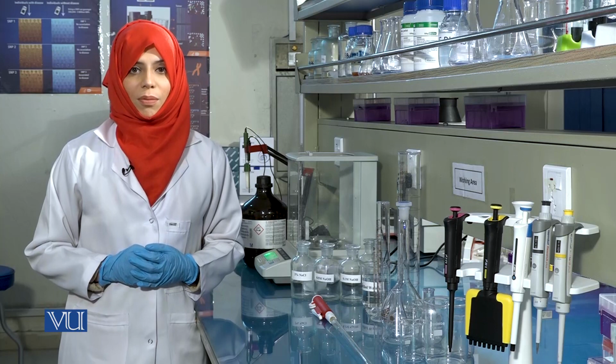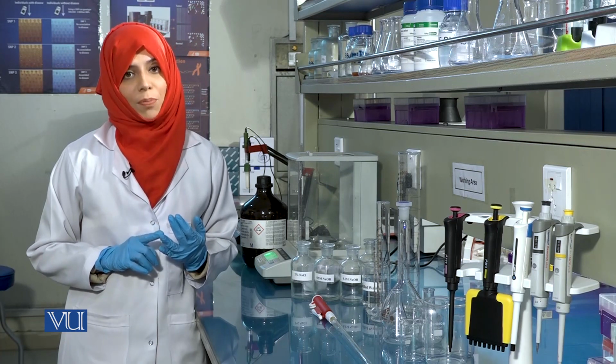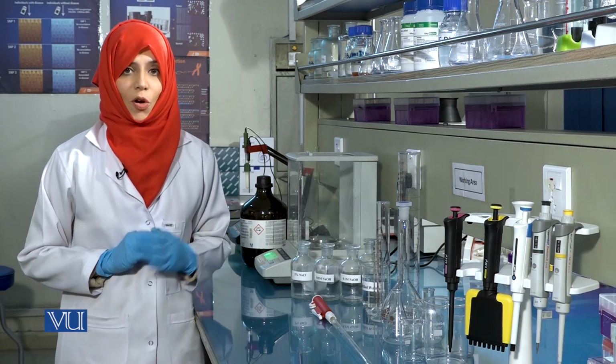Dear students, most of the reagents used in the scientific laboratory are in the form of solutions that need to be prepared or purchased. For some cases, the exact concentration of the solution is not important, while for other cases, the concentration and the method of preparation of the solution need to be as accurate as possible. Today, we will learn how to make solutions in the laboratory.